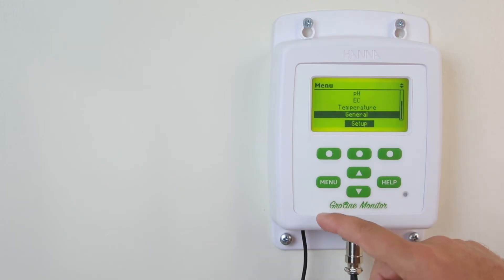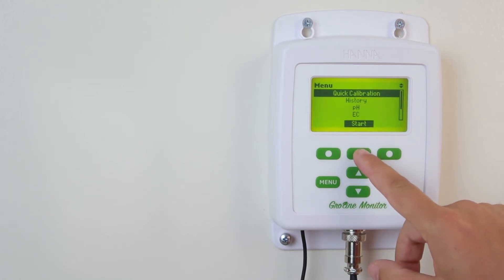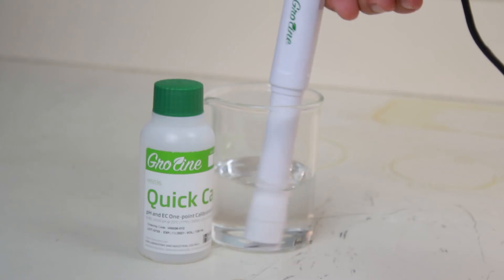Calibration is an important step in making sure your monitor is giving you the most accurate results. We recommend calibrating before each use. To calibrate your monitor using Hanna's Quick Cal solution for both pH and EC-TDS, enter Quick Calibration mode by pressing menu, Quick Calibration, and then start. Now place your probe into your solution and stir gently.